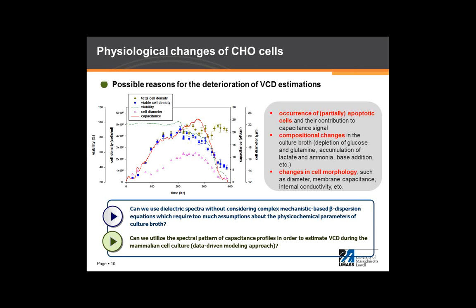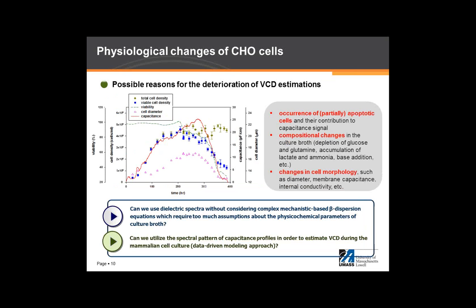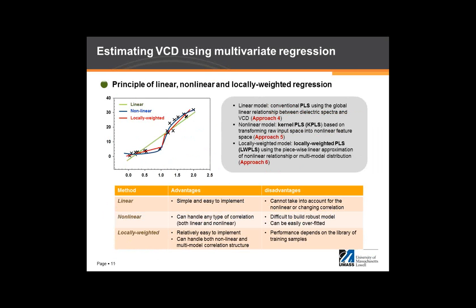We need to capture them all somehow by dielectric spectroscopy. Based on this slide and the previous slide, this justifies why we need to look at the whole spectrum instead of the dielectric spectroscopy value at a specific frequency. So based on this justification, we decided to look at the full spectrum. Then what is the methodology that we can use?